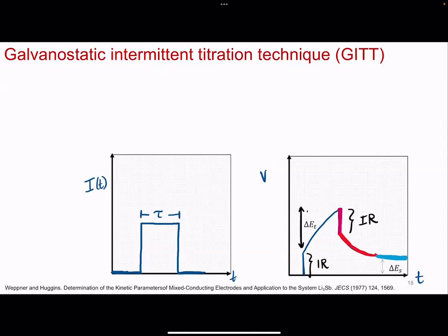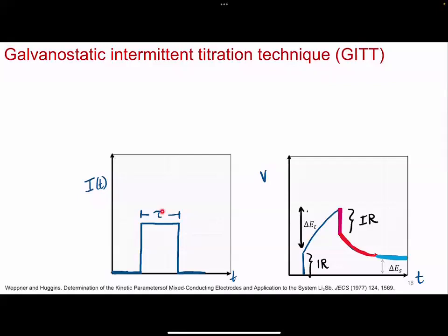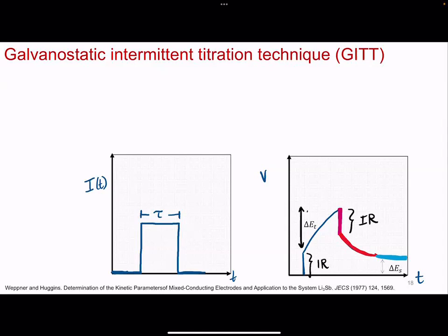It's galvanostatic, so you apply some constant current, as you see here, with the pulse over time t. How you develop this technique, or what pulse you apply, and how long you wait for relaxation, really depends on the material. And even for the same material, what we'll see in part 2 of the electrochemistry series is that it can vary quite widely. There has to be some understanding of the phase as well.